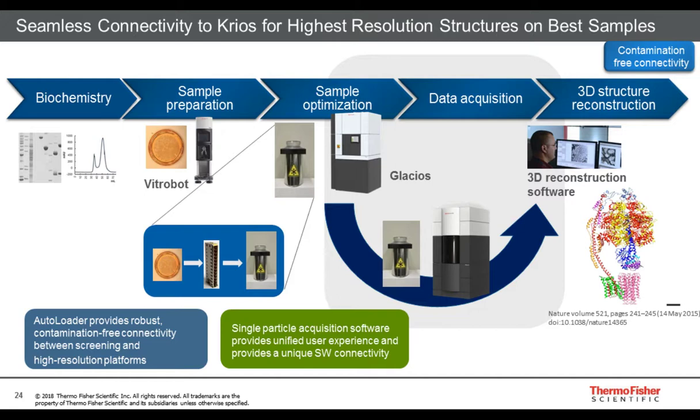Optically wise, this microscope is capable of easily achieving resolutions better than 3 angstroms, and routinely, as was shown in the next slide, 2.5, 2 angstroms, and even better beyond that. That's not unrealistic, depending on how the sample has been isolated, and the type of sample. The heterogeneity of the sample also plays an important role here.